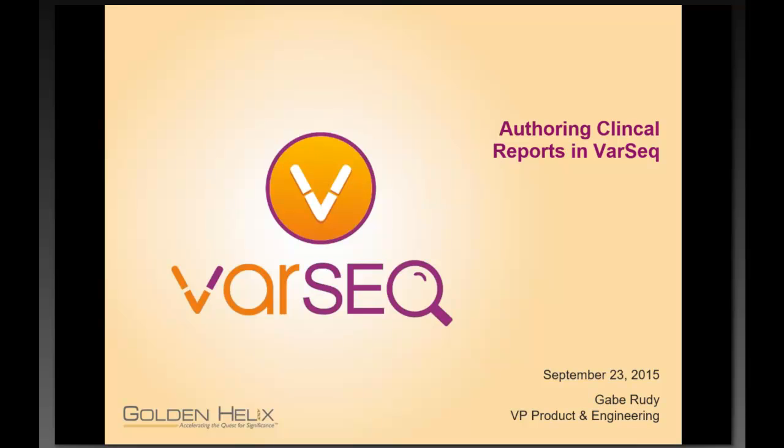I'm Cheryl Rogers, the Director of Marketing here at Golden Helix. Today, Gabe Rudy, our VP of Product and Engineering, will present the newest addition to the VarSeq software suite, VS Reports. VS Reports takes the output of your tertiary analysis to a customized clinical report in just one click. Gabe, I know you're excited, so I'll pass the mic to you.